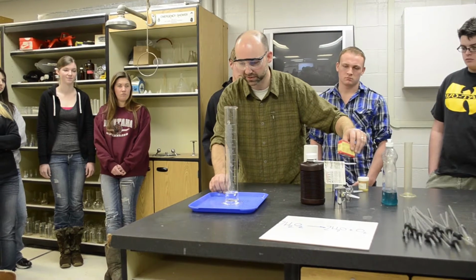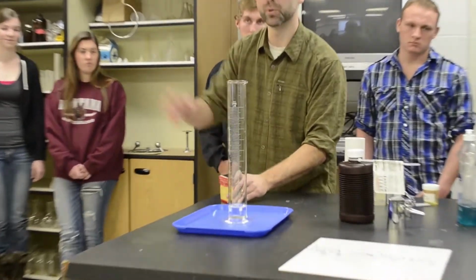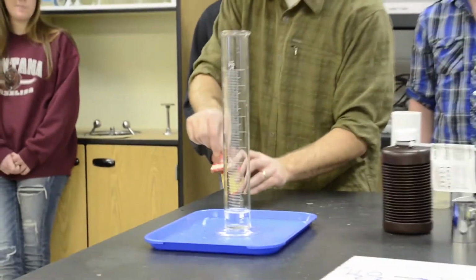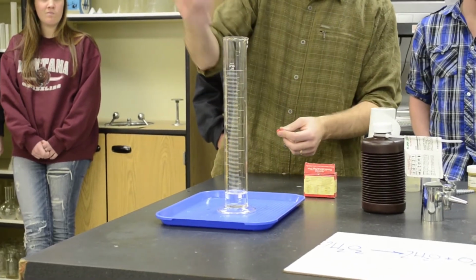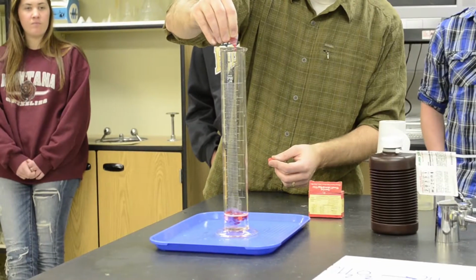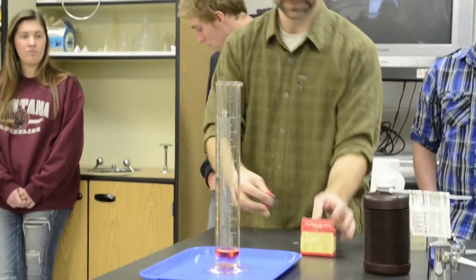A catalyst, and we'll talk about this in just a moment, is like that enzyme. It brings the particles closer together. And what it does is it provides an alternative mechanism for the reaction to happen in. This is not the catalyst. This is just ordinary food coloring, just to give it a little bit of color so you can see it better.